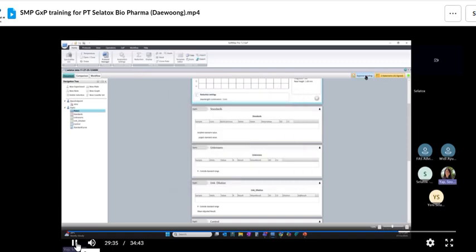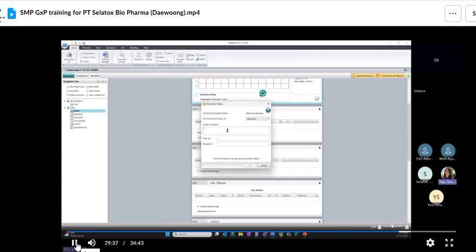Okay. Then lastly, you can approve it. And the password, before I click OK, right?